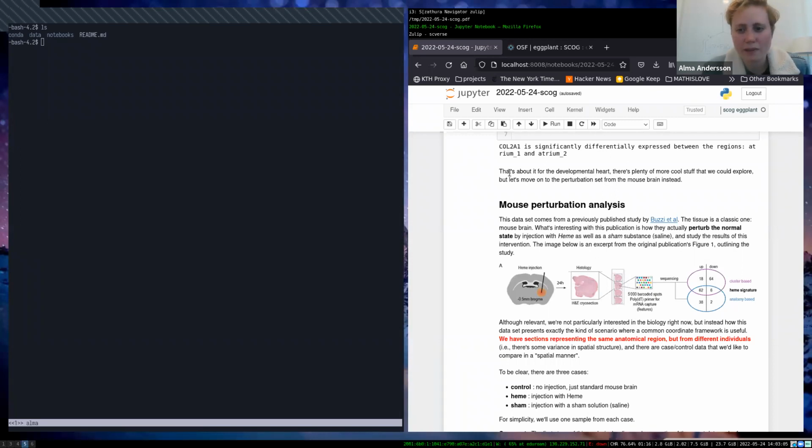I think that's something that's completely up to the person who's initiating the analysis. You can change or introduce new annotations to the reference once you transfer the data, because the annotations aren't really related to the transfer process. It's just something that we have associated with the observations or locations within the reference, and that can be changed or re-annotated in any way we want to. I think you should annotate your reference according to the number of regions that you find relevant and what represents relevant regions to you. So that's super hard to give a general answer to, actually.